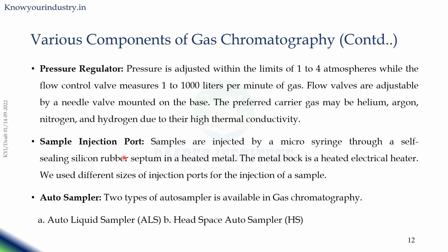The next is the sample injection port. Basically the samples are injected by a micro syringe through a self-sealing silicone rubber septum in a heated metal block. The metal block is heated by an electrical heater. We use different sizes of injection ports for the injection of a sample.